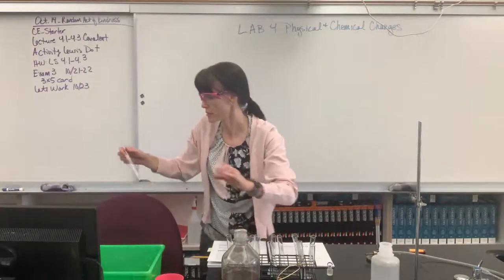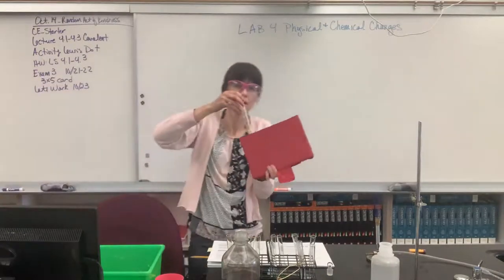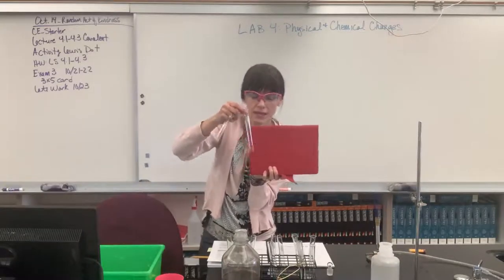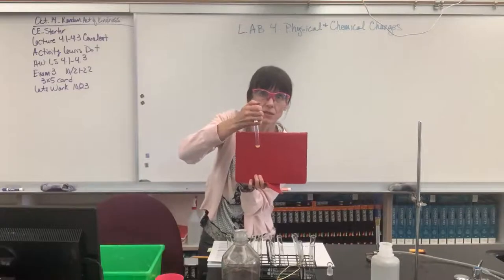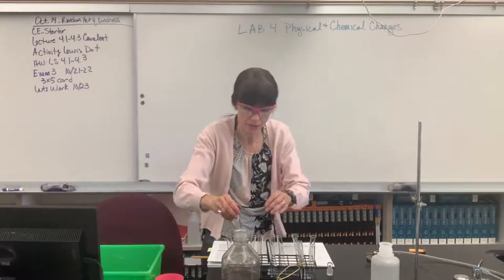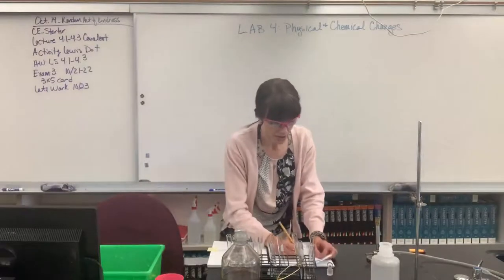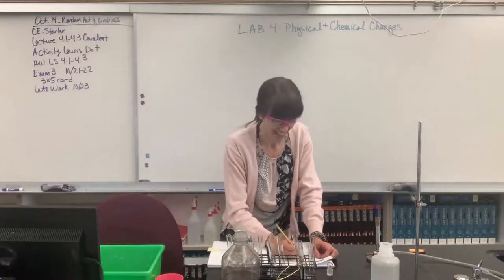Let me show you against the red of my iPad. It's definitely cloudy. Cloudy yellow. Here's clear yellow. You can't even see it against the red. And then there's cloudy yellow. You can definitely see it against the red. Cool. Okay, so let's record that. It's cloudy yellow. So the result of adding the silver nitrate to this solution is also going to be that opaque, or you could put cloudy, that's totally fine, yellow.